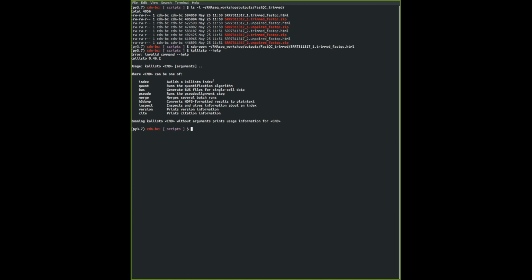and figure out where exactly this is in a transcriptome, and then perform some sort of downstream pattern matching to create some sort of accuracy score, confidence score. If there's a high enough confidence for that sequence to be mapped, it will assign that particular input sequence to that transcript, or to that genome or transcriptome. In this case, Kallisto does transcriptome mapping. You do it again and again until you finish mapping the entire list of sequences, and it provides some sort of output in the form of a count matrix.